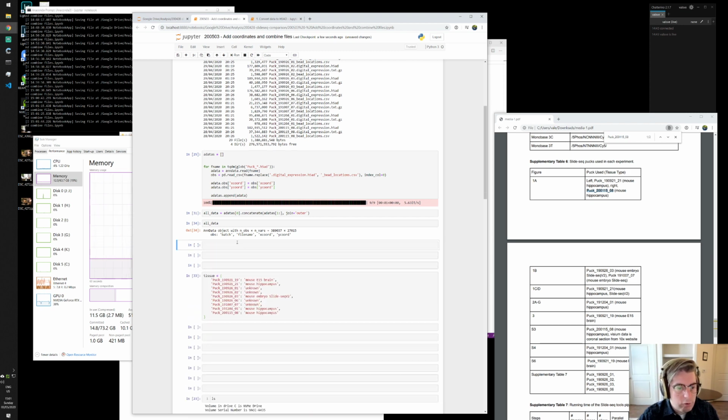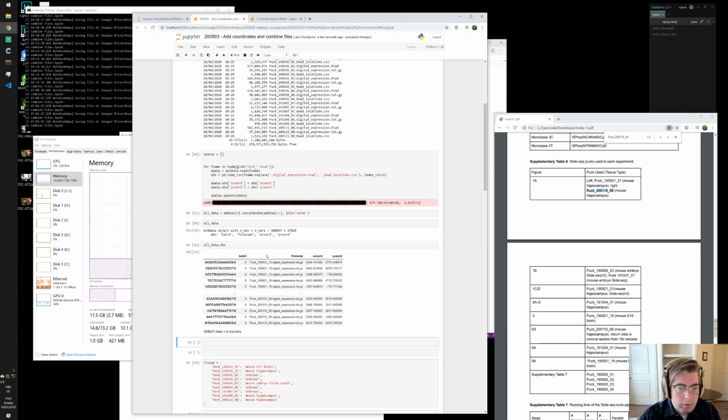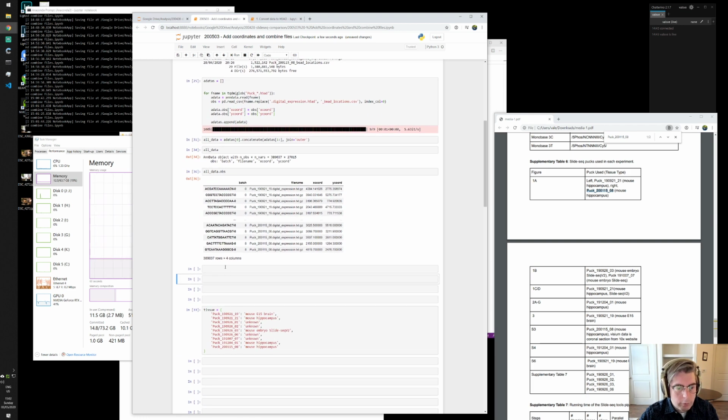So now I want to add this tissue annotation to it as well. So in the obs, I saved this file name. What I want to do from that is extract the first bit of the file name before the .digital gene expression, because that's how I annotated the tissues in this little mapping.